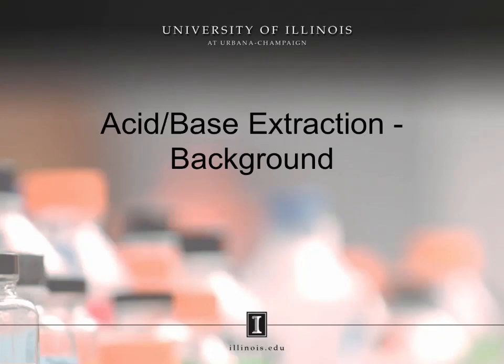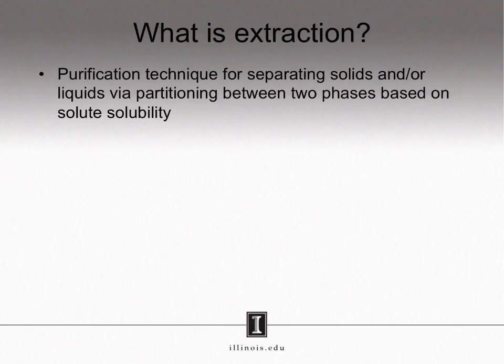Acid-base extraction, background. In this webcast, we will discuss what an acid-base extraction is and how it works. An extraction is a purification technique that separates solids and/or liquids via partitioning between two phases based on solute solubility.